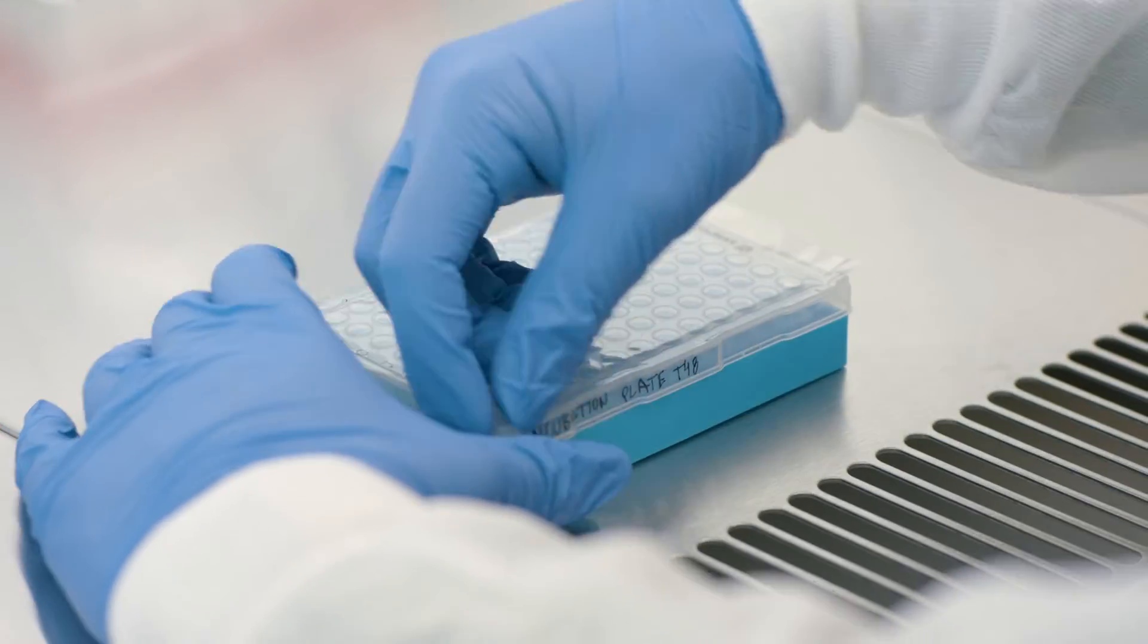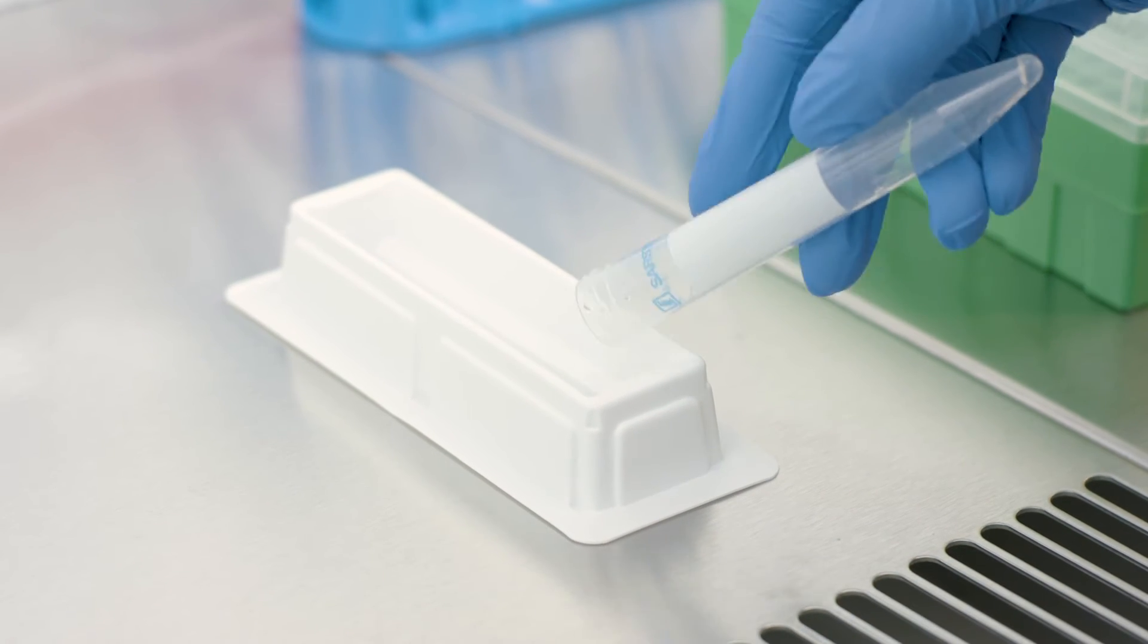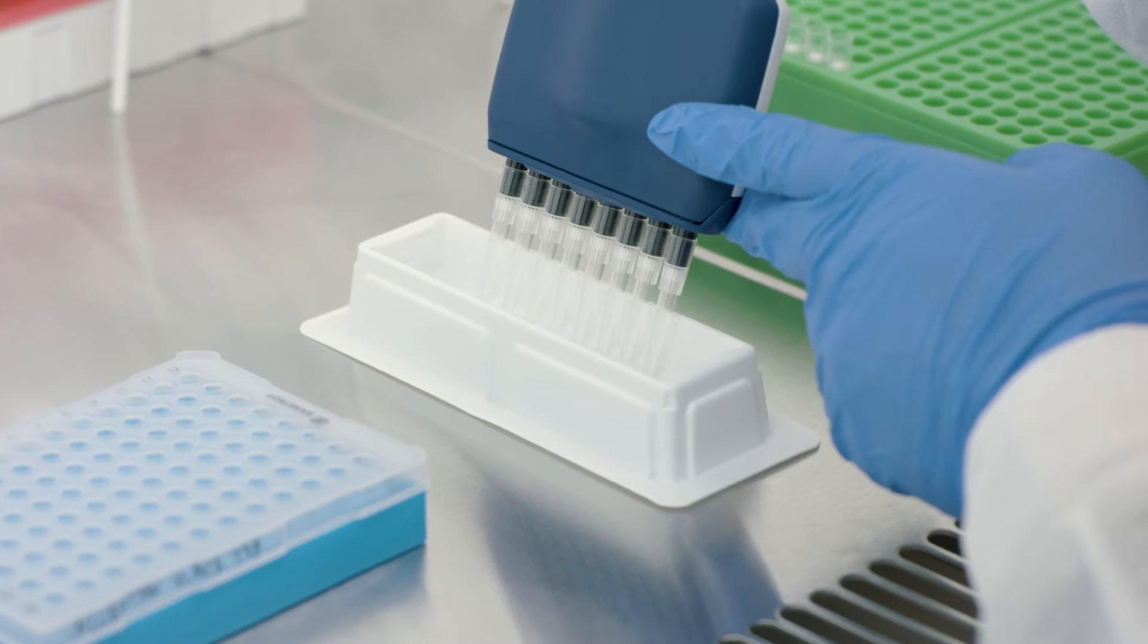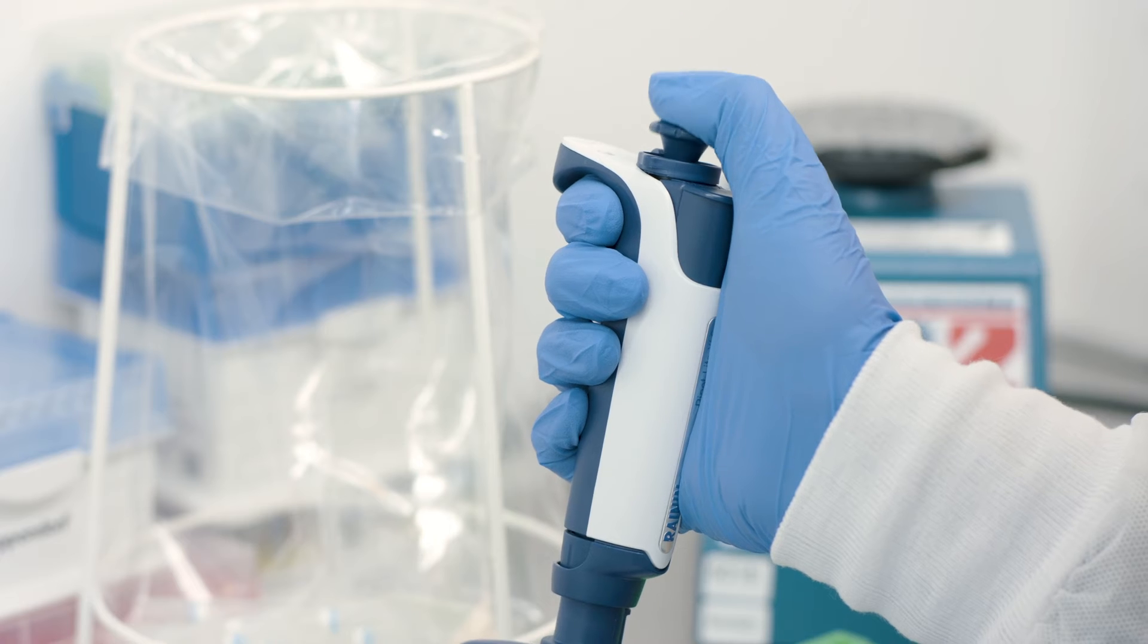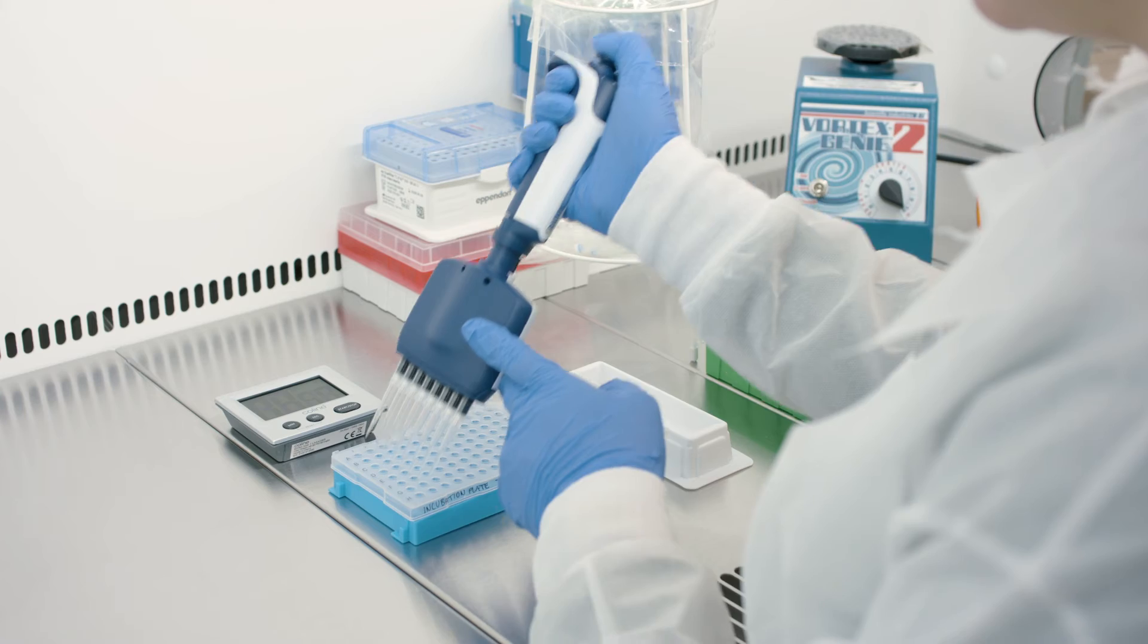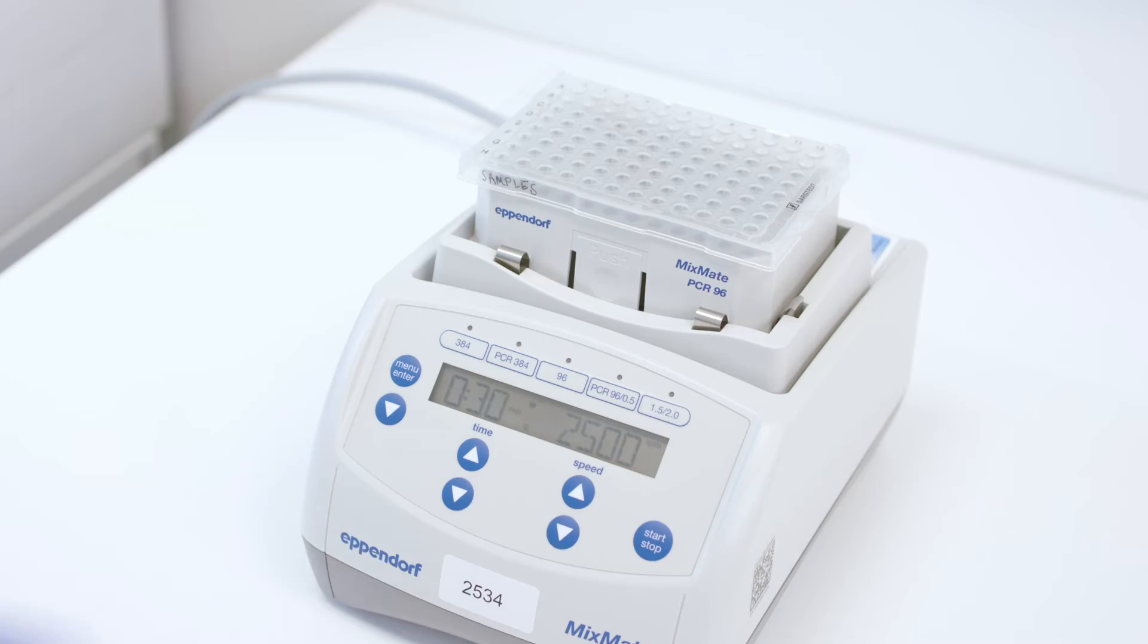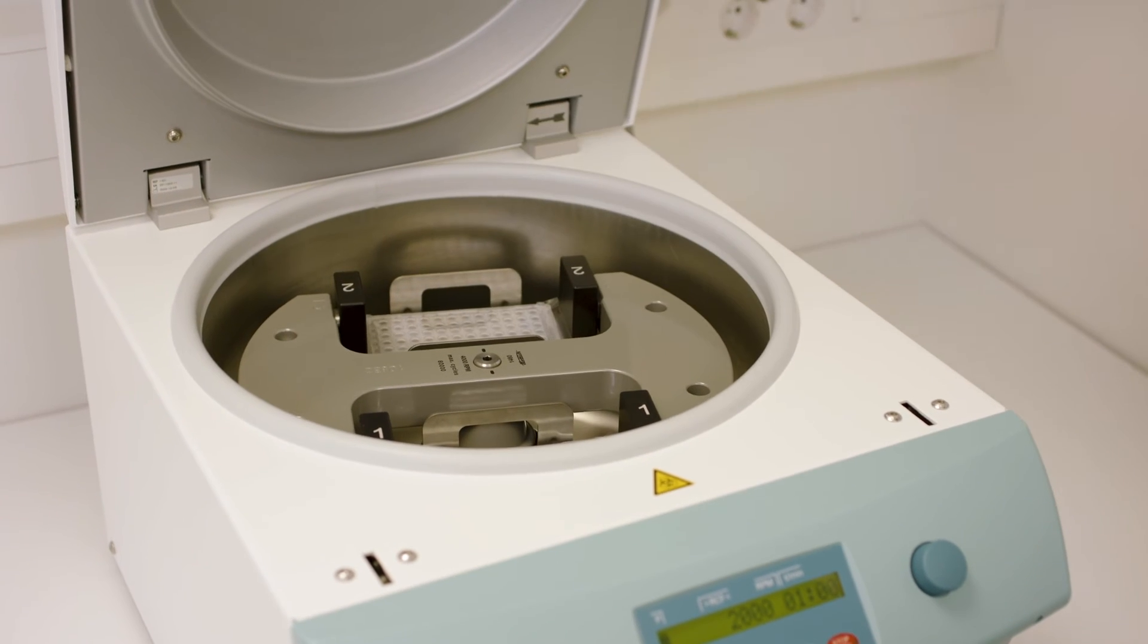Spin down the incubation plate, and carefully remove the adhesive film. Vortex the extension mix, and pour into a multi-channel pipette reservoir. Precondition 200 microliter multi-channel pipette tips using extension mix before proceeding. Use the same pipette tips for the entire plate. Start a timer set for 5 minutes, and transfer 96 microliters of extension mix to the incubation plate using reverse pipetting. Seal the plate with a new adhesive plastic film, and vortex thoroughly to ensure all wells are mixed, before spinning it down for use in the next step.